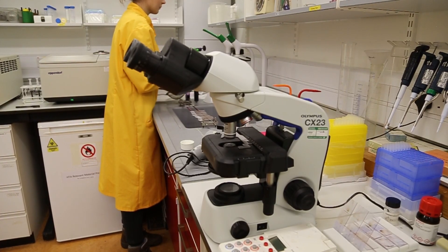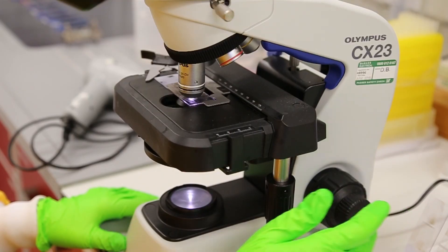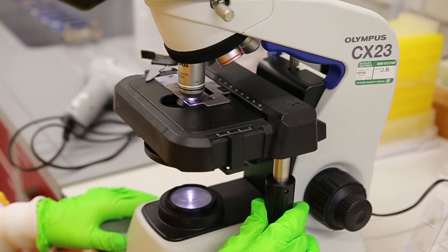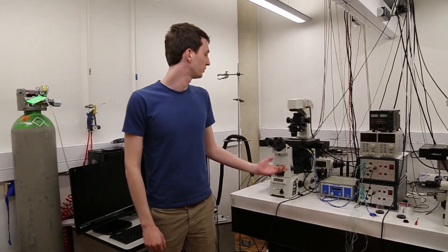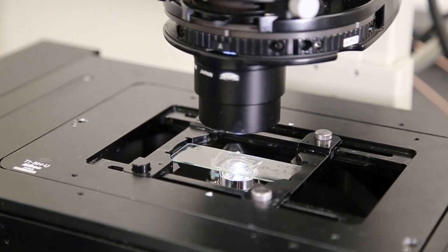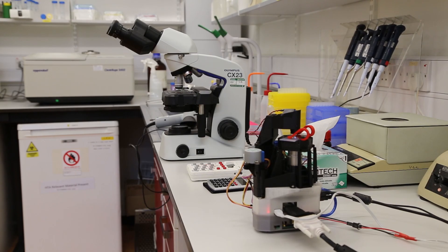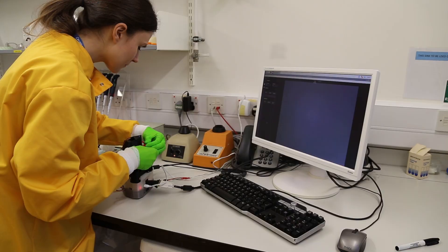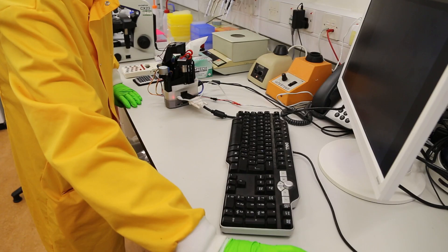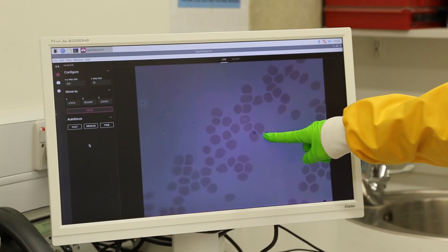A lot of biological and medical research requires the use of a microscope. The majority of these have used the same design for hundreds of years — they are controlled by hand, and observations are made through an eyepiece. Many research labs use automated microscopes such as this one, but they tend to be large and expensive. In contrast, the OpenFlexure microscope is small, meaning that an automated microscope can fit on any lab desk. This opens up the possibilities of automated microscopy to many more users. They are able to control the position of their sample with the built-in computer, view images on a screen, and save them for later analysis.